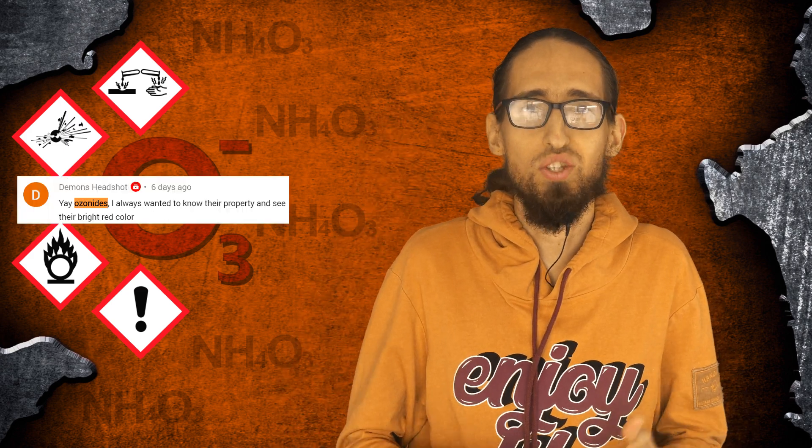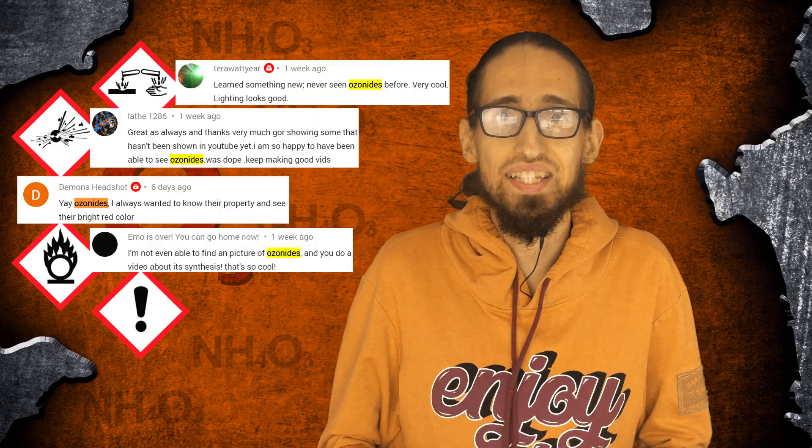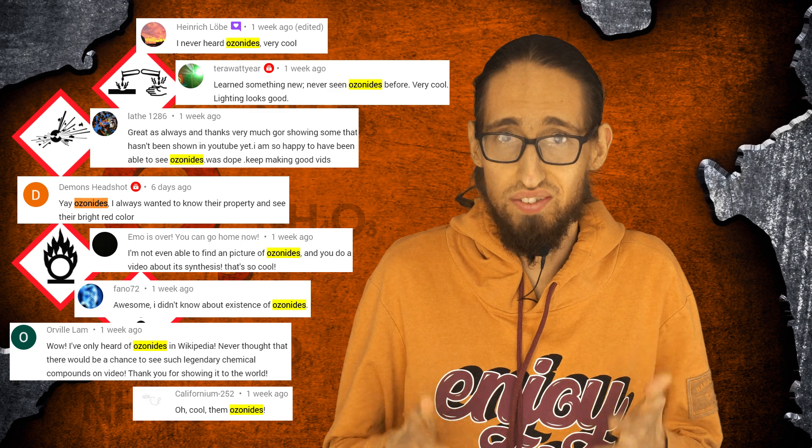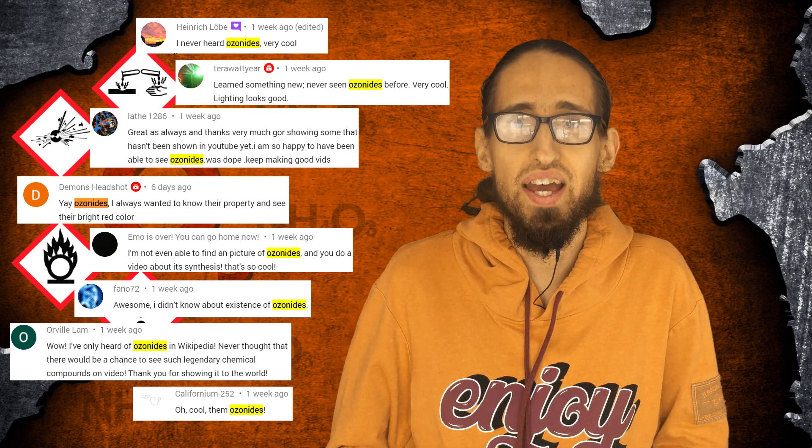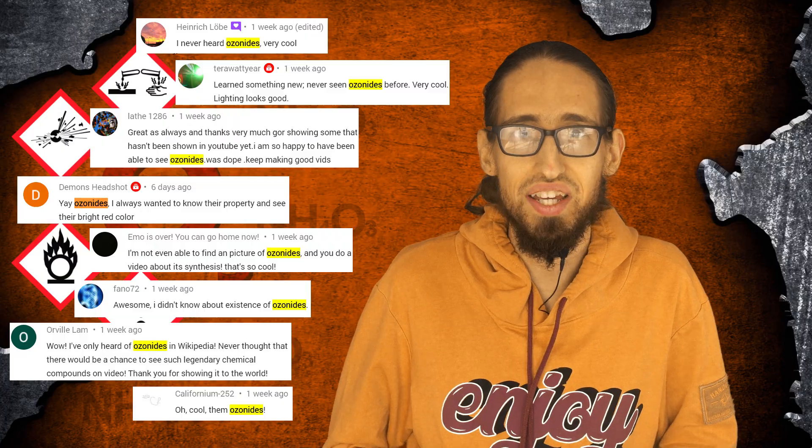Hey guys! Judging by your comments to my previous video, you were quite excited to see alkaline metal ozonides for the first time. So in this video I decided to show you one more ozonide, which is ammonium ozonide.